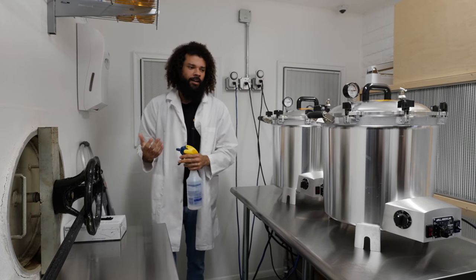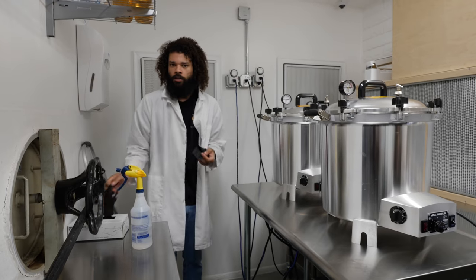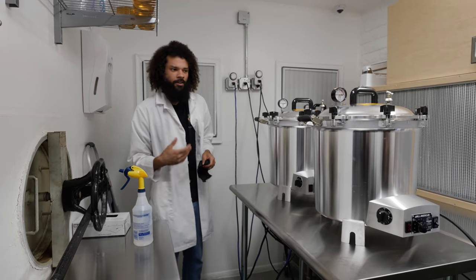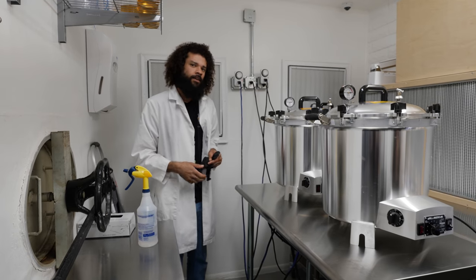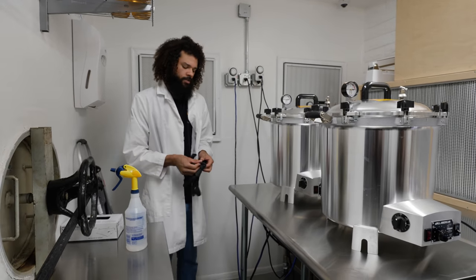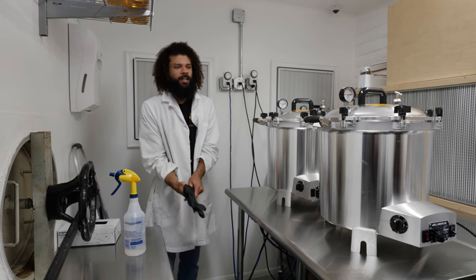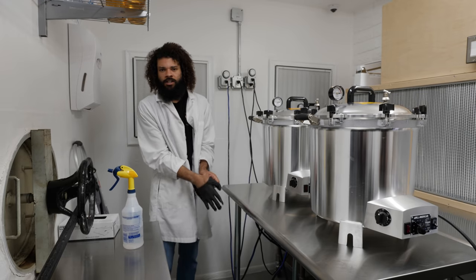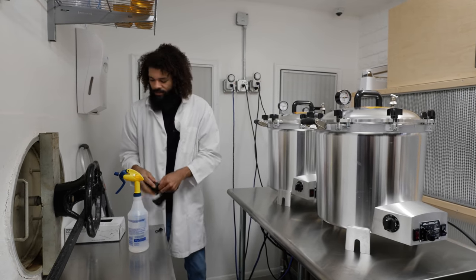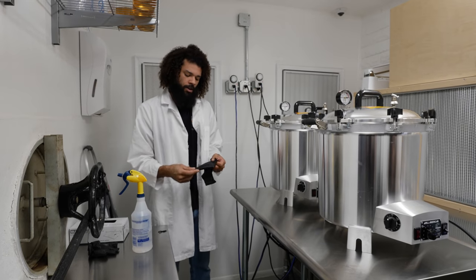So right now we're in the laboratory. This is actually a newer lab that I put together and I'm primarily utilizing it for mostly spawn and culture type production. This way I can kind of take some of the load off the other lab, which is mainly used for inoculation of sterile sawdust and bulk substrates, and just do more and be able to be more ahead.